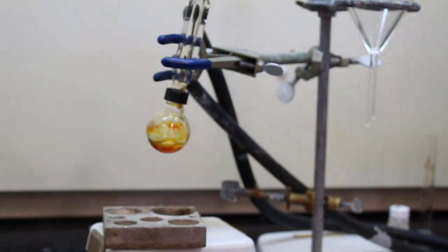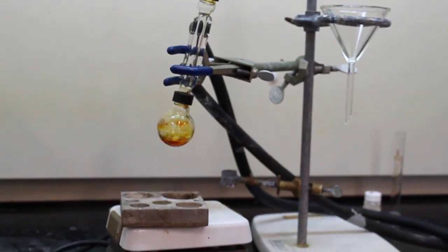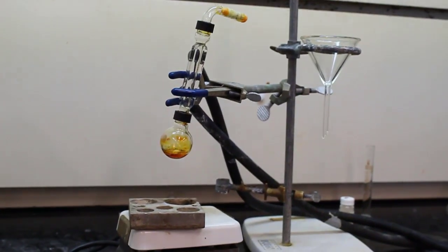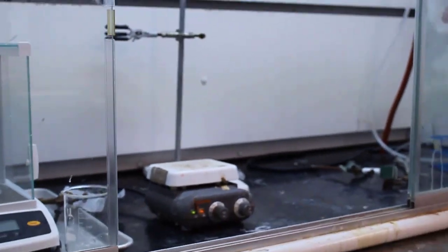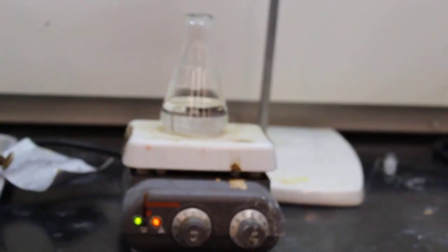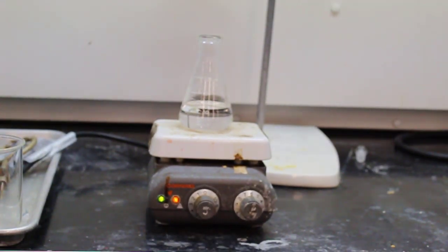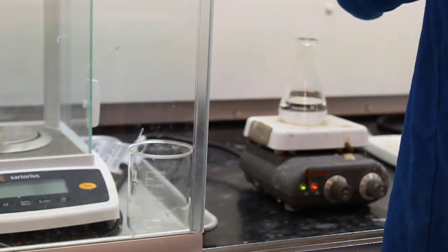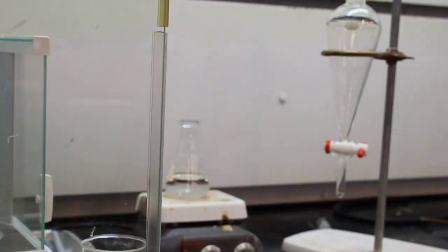Now they're removing the reaction mixture — you can see that nice red tint — and allowing it to cool to room temperature. Meanwhile, a hot plate is being set up to heat 60 milliliters of 60% ethanol. They don't want it to boil, just heat it so it'll be hot for later.